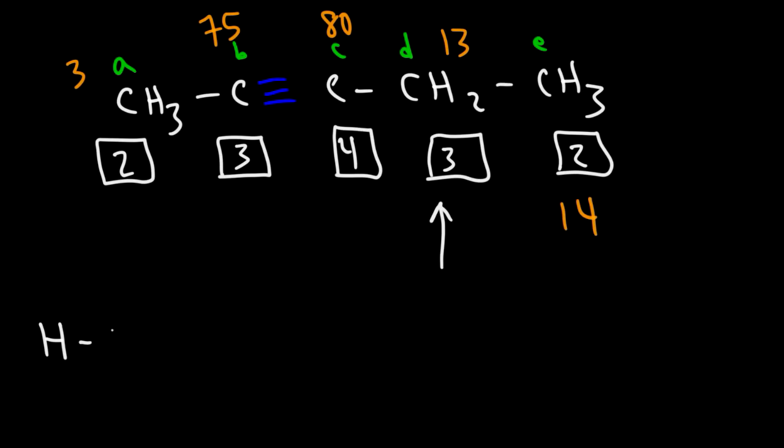Now let's consider an example with a terminal alkyne as opposed to an internal alkyne. Now let's see what we can learn from it.